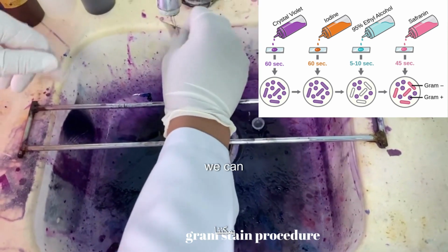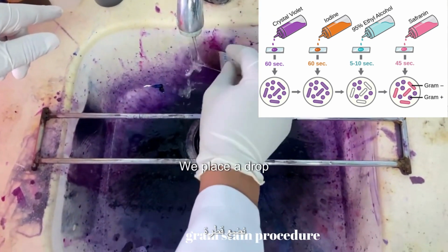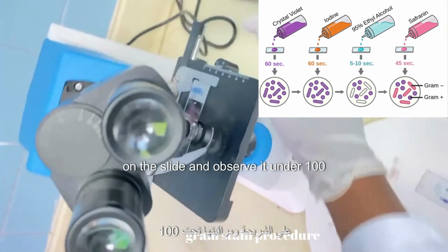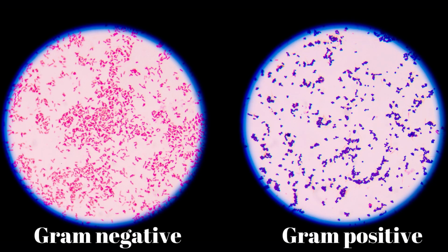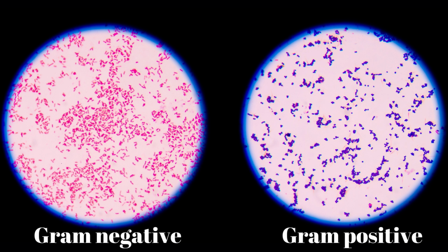Then we can see the slide under a microscope. We place a drop of immersion oil on the slide and observe it under the 100x objective. Gram-positive bacteria appear purple. Gram-negative bacteria appear pink or red.